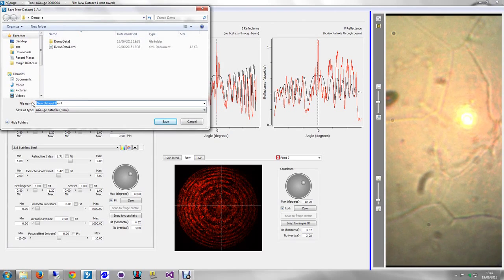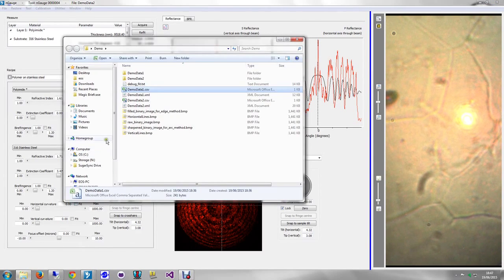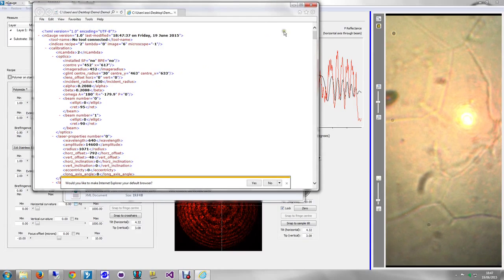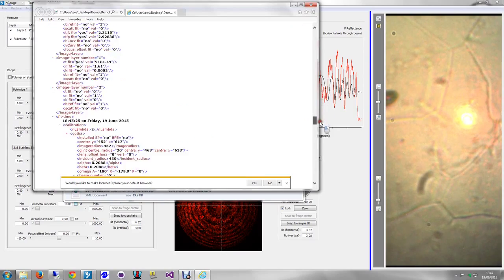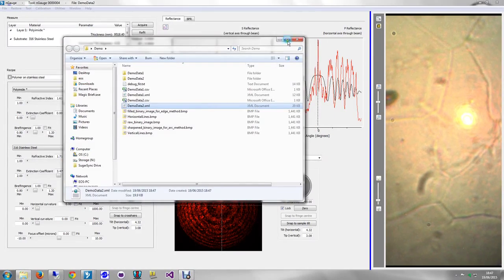Once the measurement is complete, the n-gauge holds the results in memory, and every measurement is time-stamped so that there's a record of exactly when it was made. The data can then be exported into a standard file format such as CSV or XML, and it can be analysed offline, or it can be imported into a laboratory information management system or factory automation system, and therefore it can be used for process improvement, for process control, for regulatory compliance, as well as general research and development purposes.